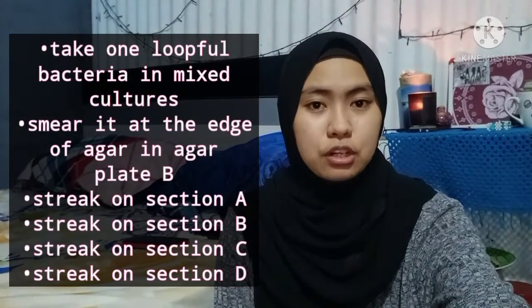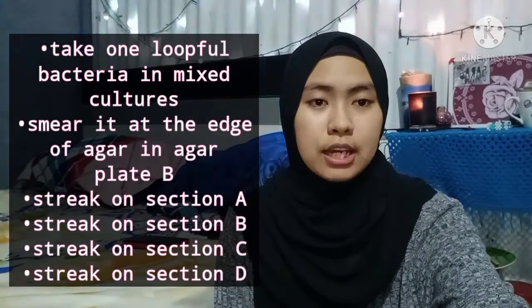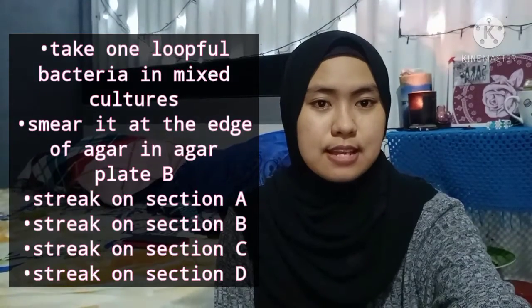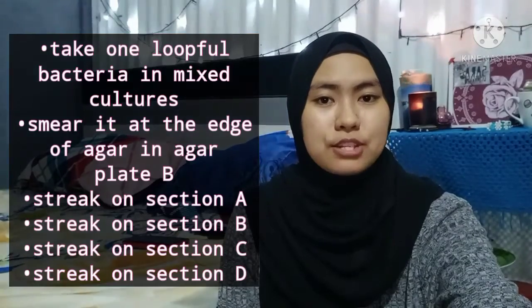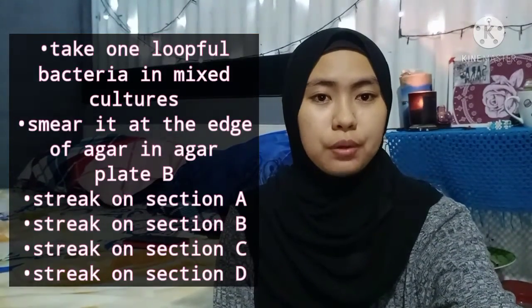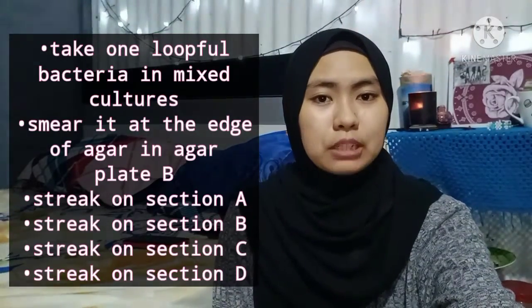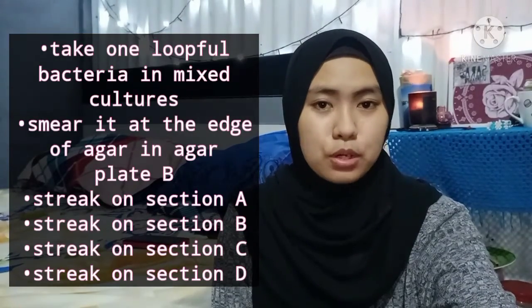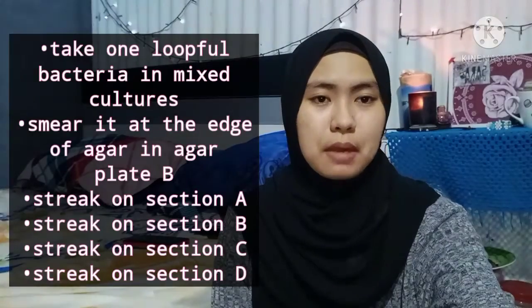After that, obtain a loop full of the mixed culture from agar plate A and put that loop full of bacteria into section A of agar plate B to make a successive streak on the agar surface. This allows the bacteria to spread out and to grow in individual colonies on the agar plate. Then flame the loop again and let it cool for a while. Again, this step is important to make sure that the loop is sterilized and kills any unwanted bacteria that are on the loop.